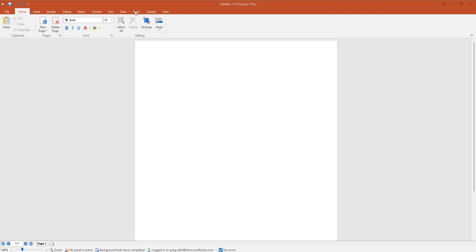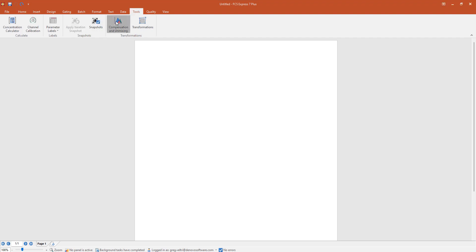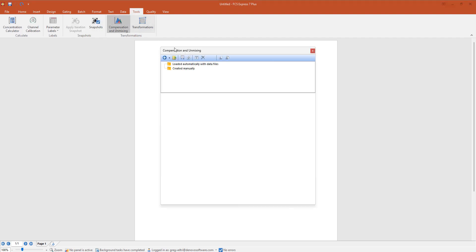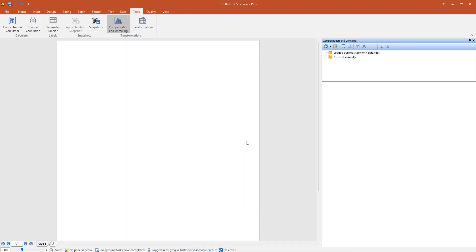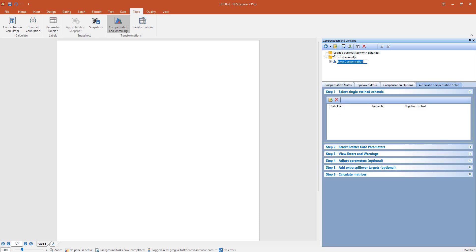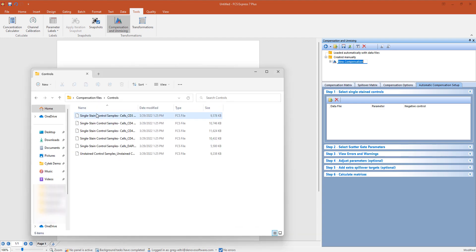With FCS Express, we first open the wizard from the Tools tab by selecting the Compensation and Unmixing button. We can then anchor the window to the side if preferred. Next, we press the blue plus button and select Compensation from the drop-down. We will now load data files into the wizard either using drag and drop as shown, or by selecting the folder icon in step one.